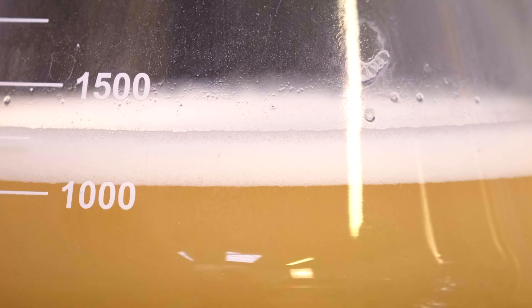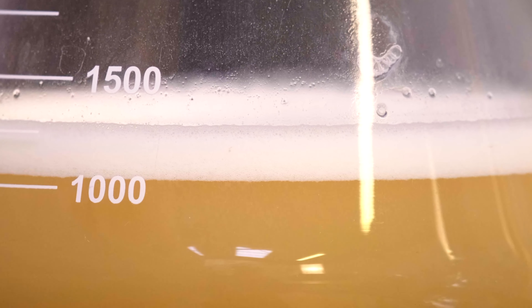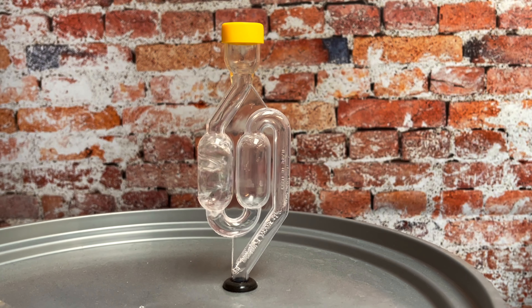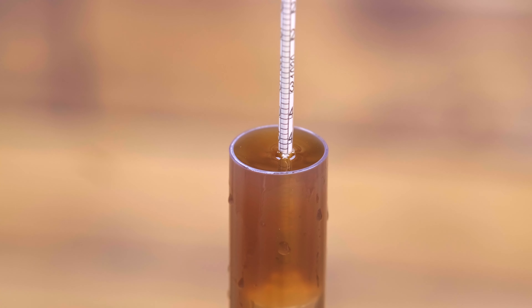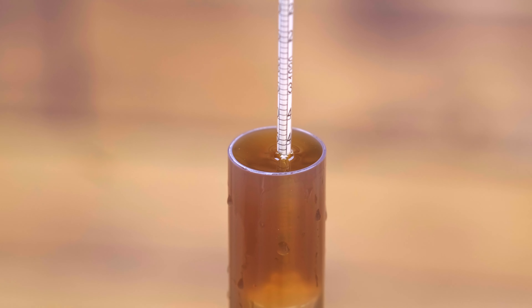We all know that there are visual signs of fermentation taking place — a beer will develop a krausen on top and there'll be CO2 produced which possibly makes airlock activity. However, if you've got a hydrometer or a way of measuring the specific gravity of your wort, you know what's going on. It should be a measured process and not a visual process. Broadly speaking, there are three different ways to take the specific gravity of your fermenting beer.